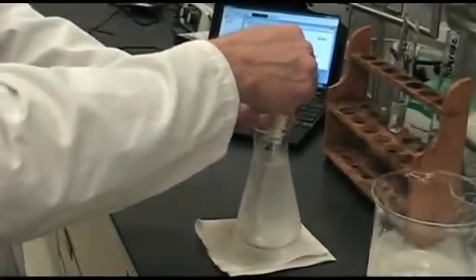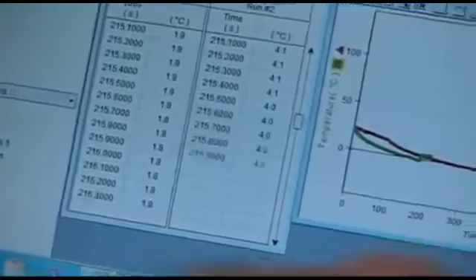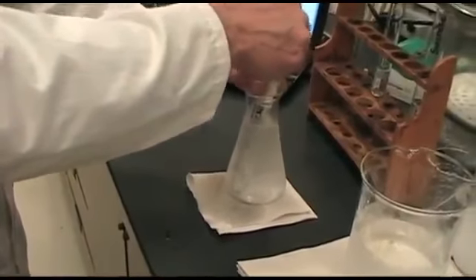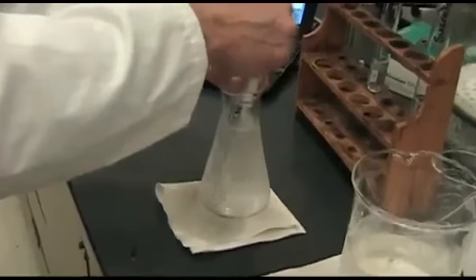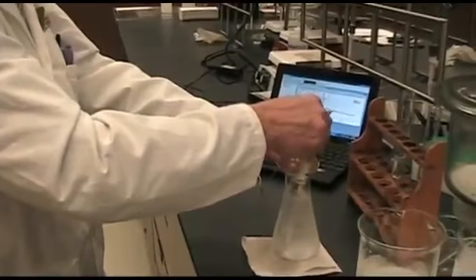So there was a point there I noticed that we were below zero, so I started stirring it. You can see that it's gone back up, which is expected as I'm adding heat by stirring it, friction, and you can see now it's going back down as I have a little difficulty keeping it above zero. I'll just continue stirring until we get a slush point and slushiness.